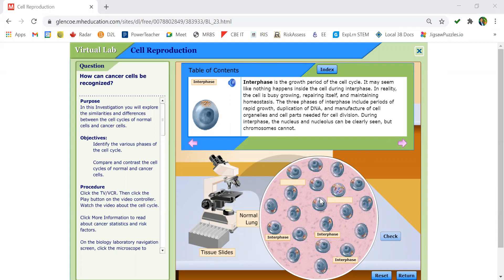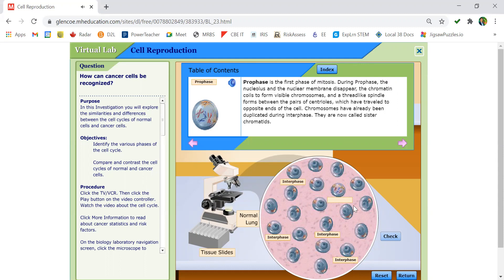I've already identified three of the cells that need labeling. The fourth one is also interphase because its picture matches the interphase picture. In interphase, the chromatin is visible but not the chromosomes. The last picture here is prophase because the chromosomes are clearly visible.